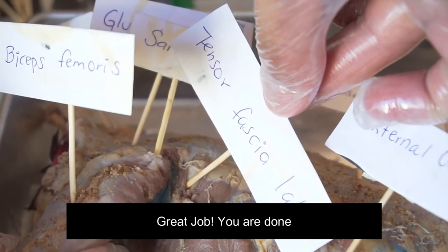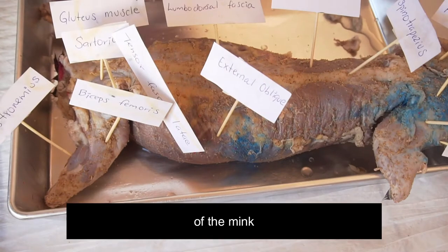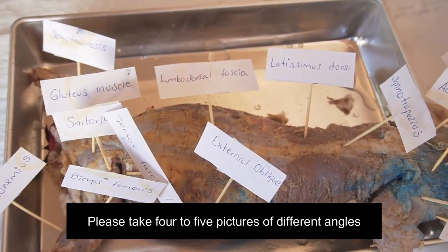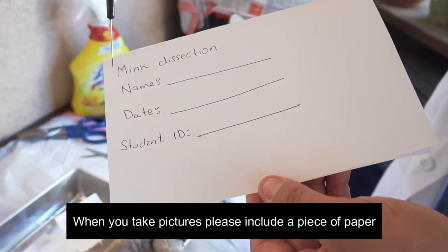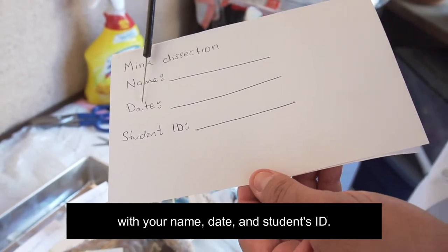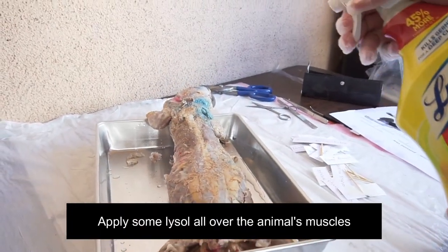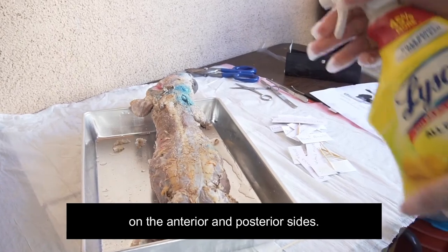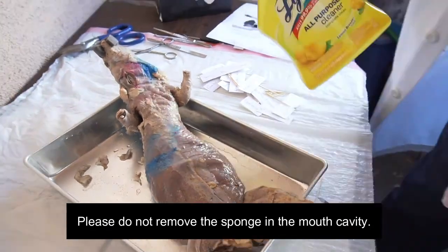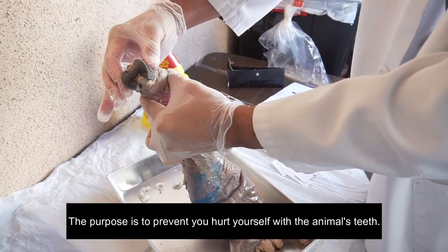Great job. You're done. You have identified the superficial and posterior muscles of the mink. Please take 4 to 5 pictures of different angles. When you take pictures, please include a piece of paper with your name, date, and student ID. When you're done, it's time to clean up. Apply some Lysol all over the animal muscles on the anterior and posterior sides. Please do not remove the sponge in the mouth cavity — the purpose is to prevent you from hurting yourself with the animal's teeth.